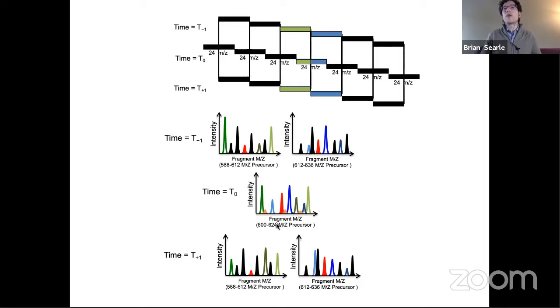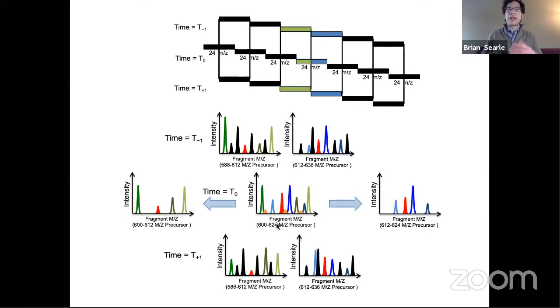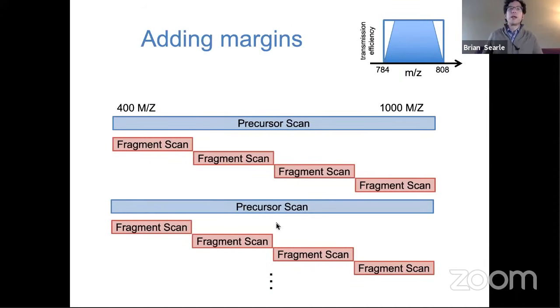Most of those ions repeat. And then there will be some ions that don't repeat whatsoever. These are typically thought of as noise. So one of the things we can do is extract these in silico into 2 different spectra that are of narrower precursor isolation windows. Essentially we can take our 24 m/z wide window data and generate 2 12 m/z wide scans. We think this is a really good method for generating narrower scans, at least in Orbitrap style instruments, and we highly recommend thinking about this.